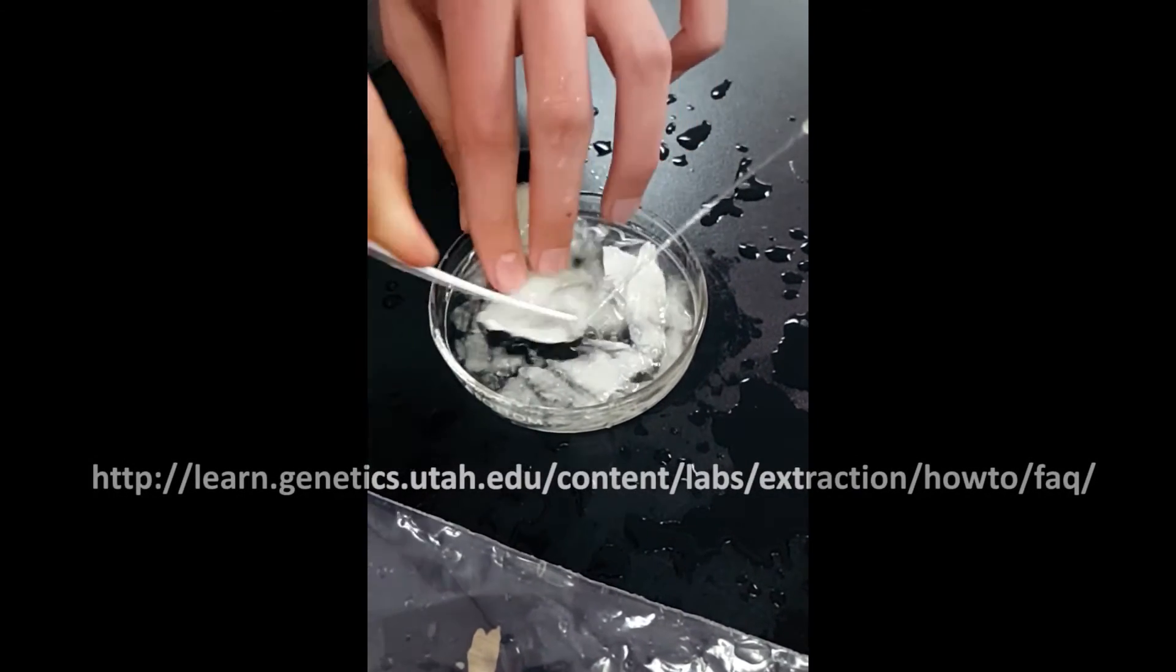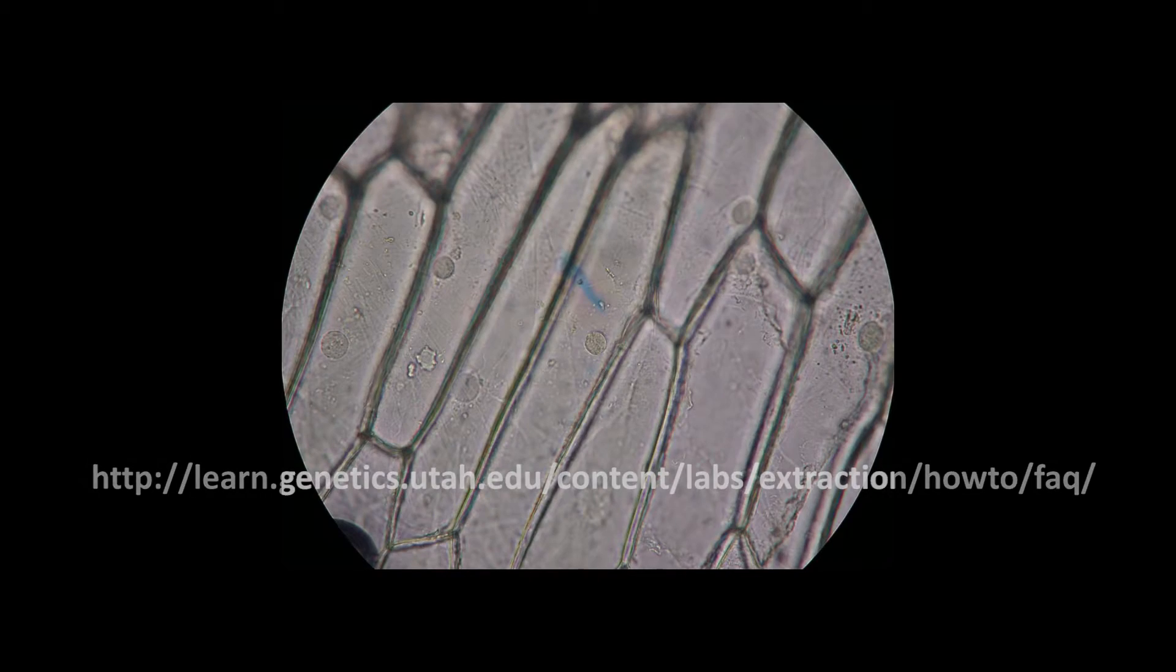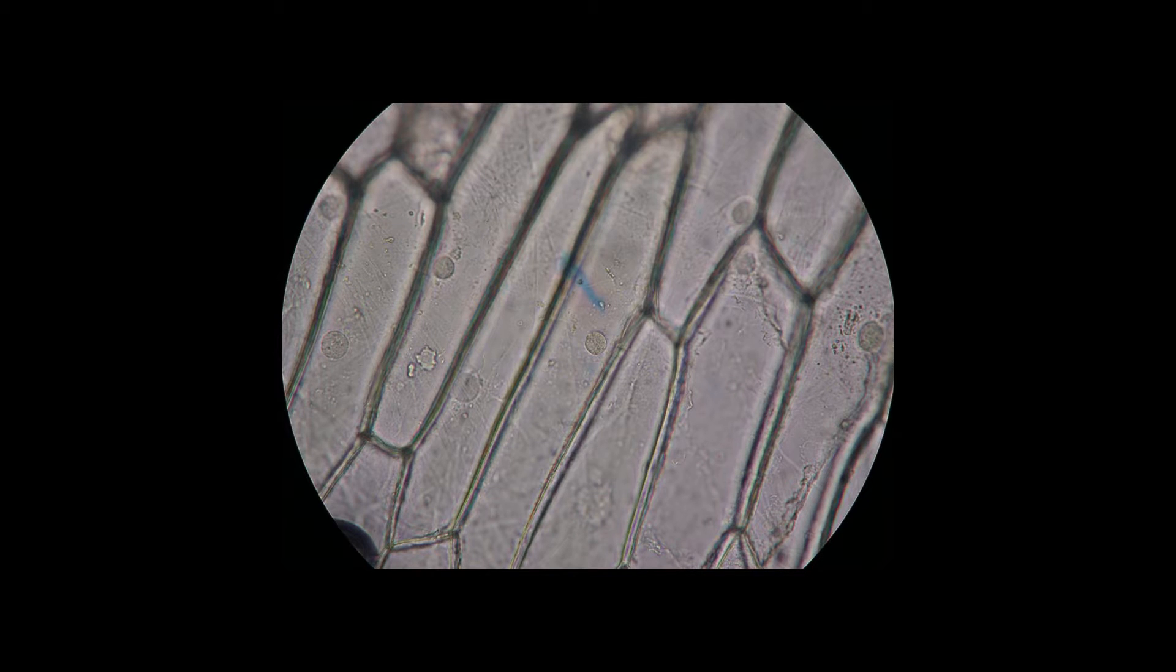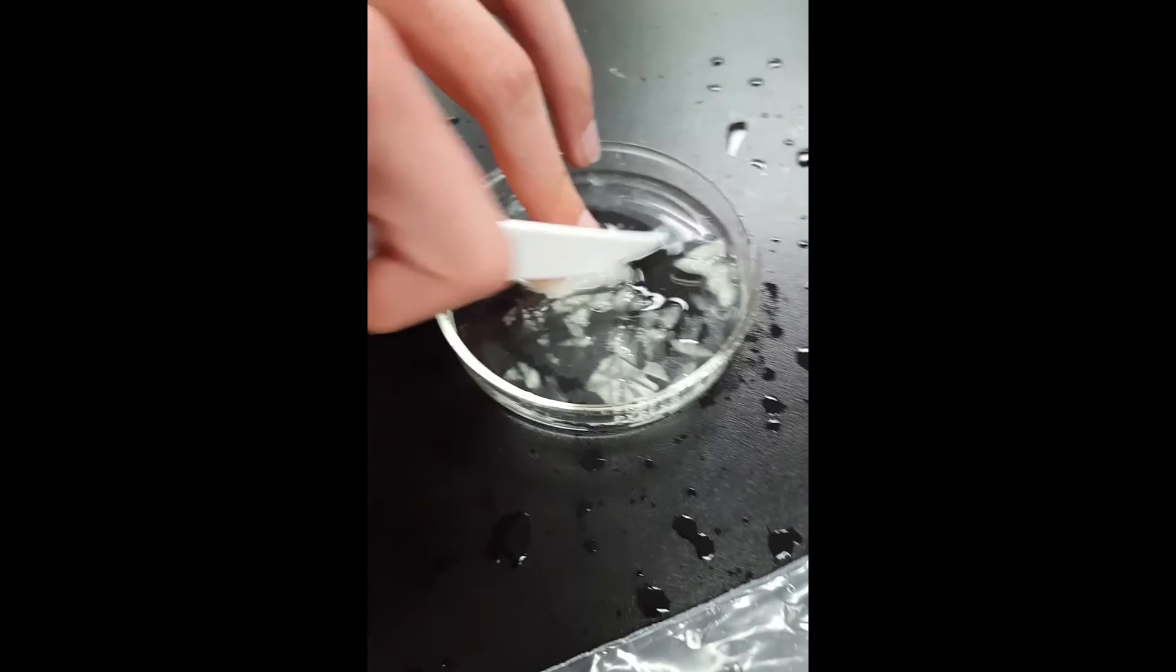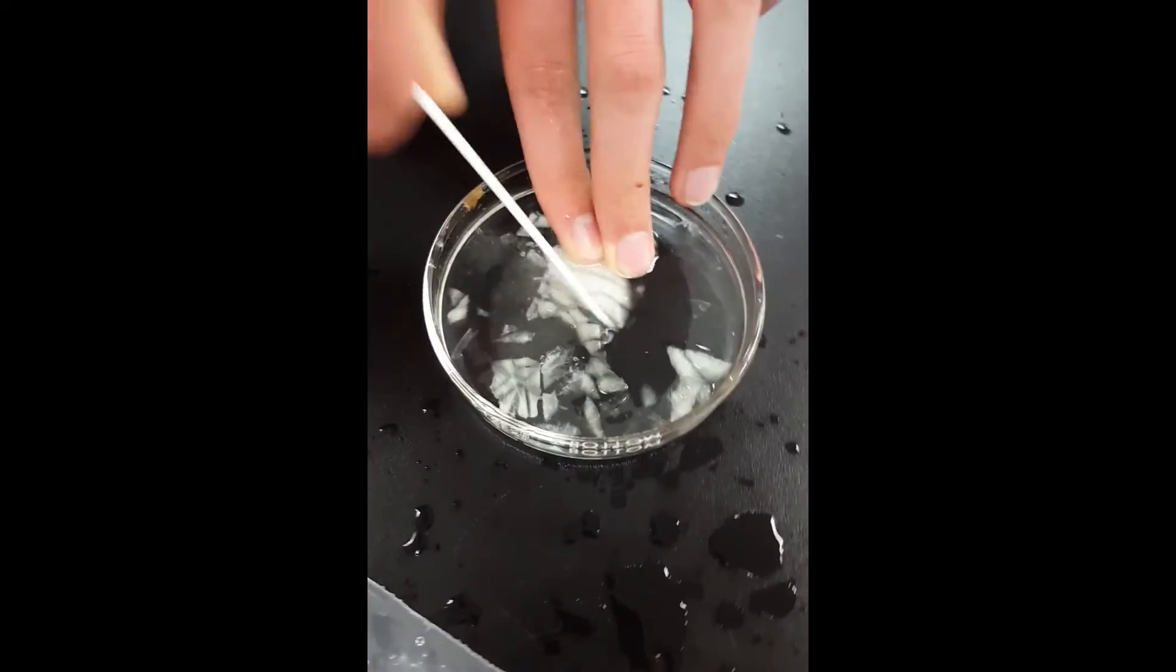We do this to break the cell walls of the plant cells so that our DNA extraction solution can enter the cell and actually extract DNA. We also do this to increase the surface area of the onion so more DNA can be extracted.